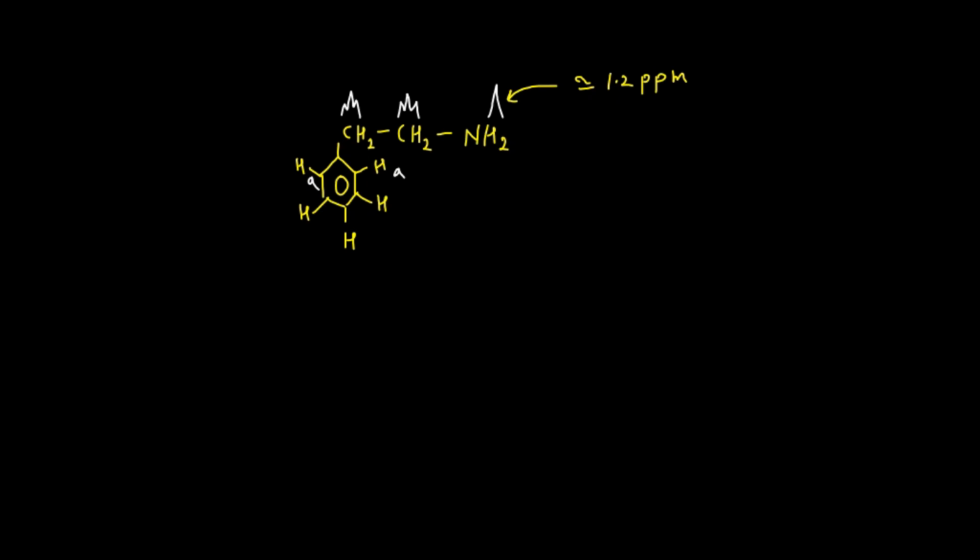Based on the same argument, these are different hydrogens which are equivalent with each other but different from Ha, because the environment of these two hydrogens is one hydrogen on the bottom and two hydrogens on the top, right? So these are different hydrogens, and this is your third set of hydrogen. The environment of this hydrogen is only two, so these three groups form on the benzene ring, and this is the very common pattern of the monosubstituted benzene.